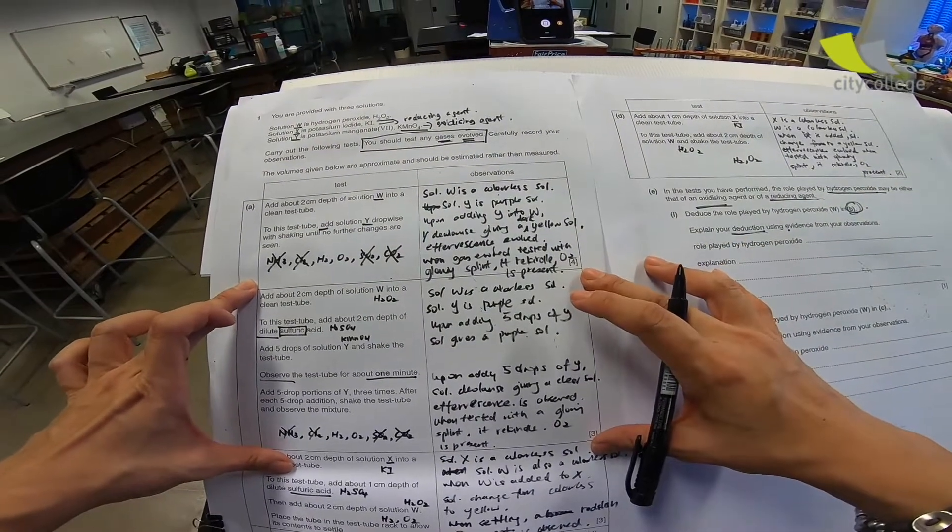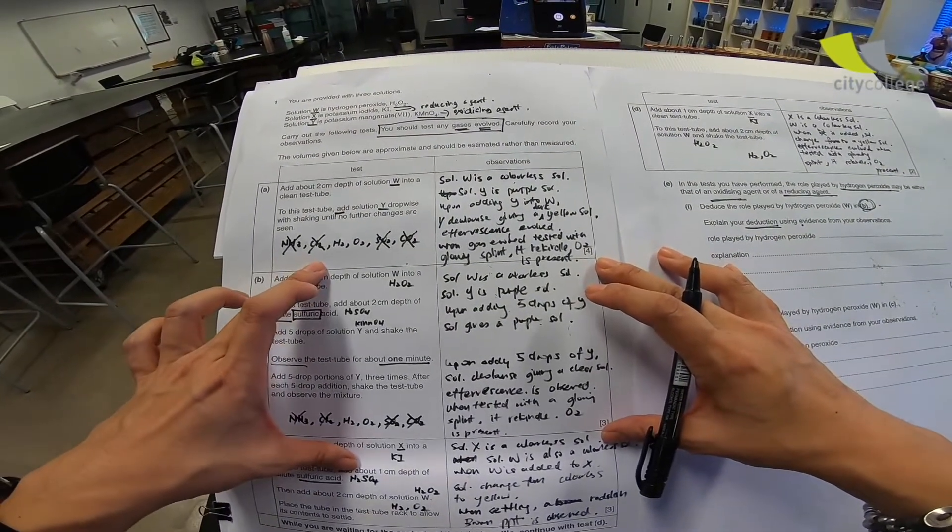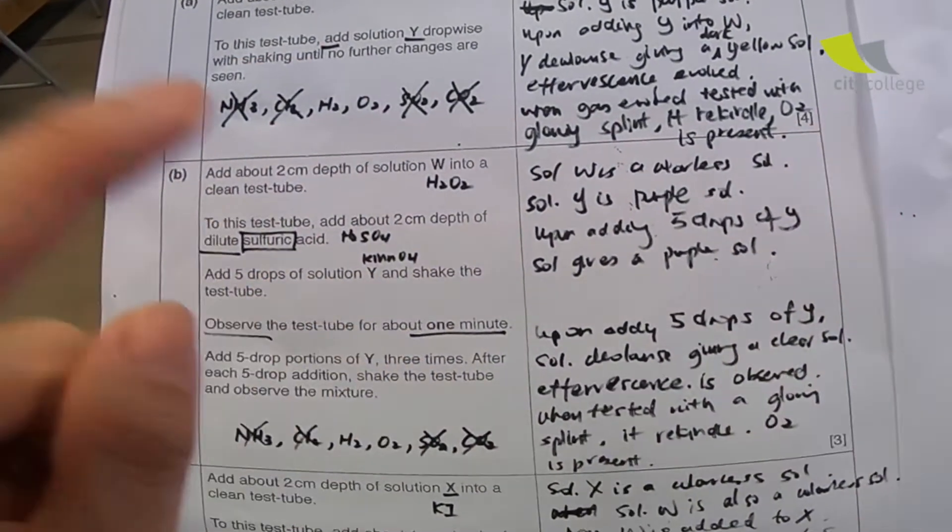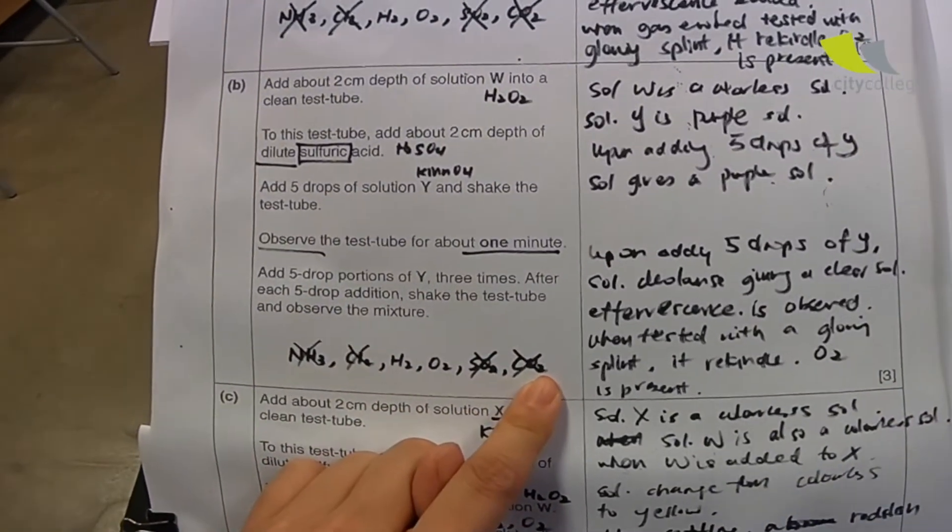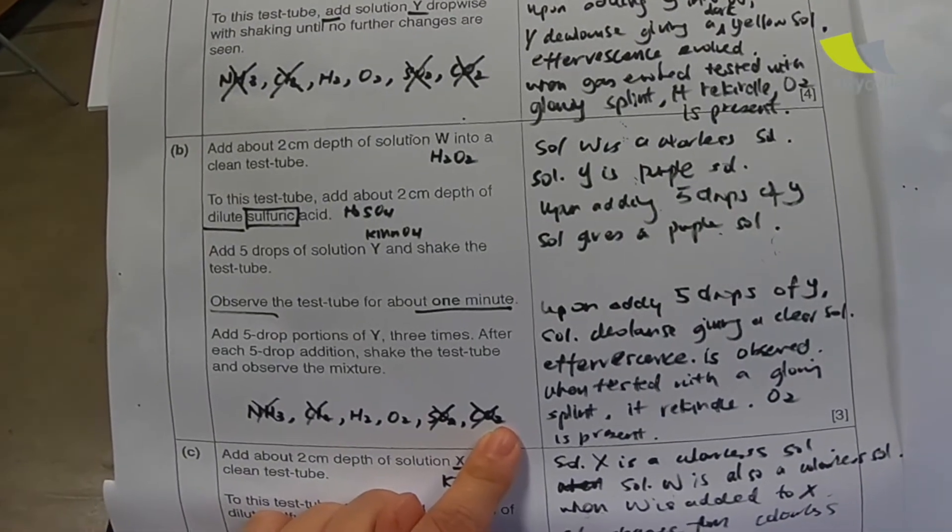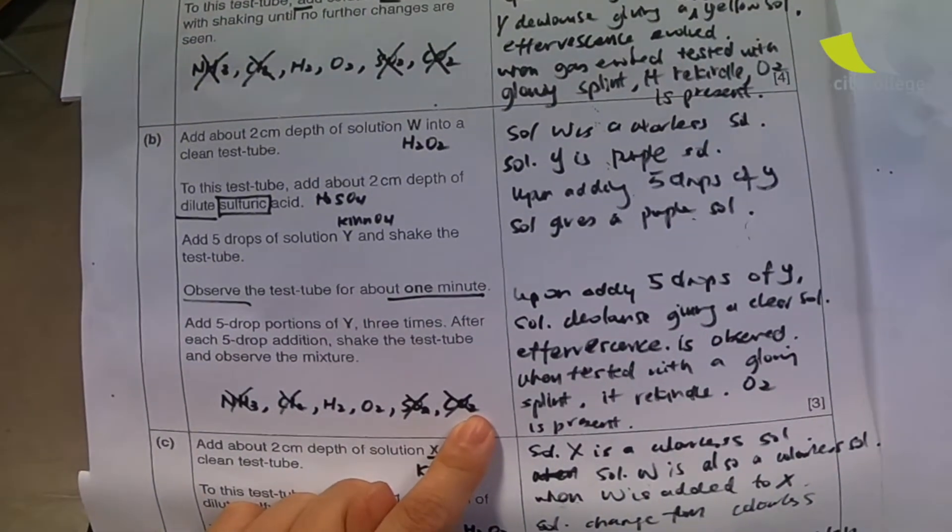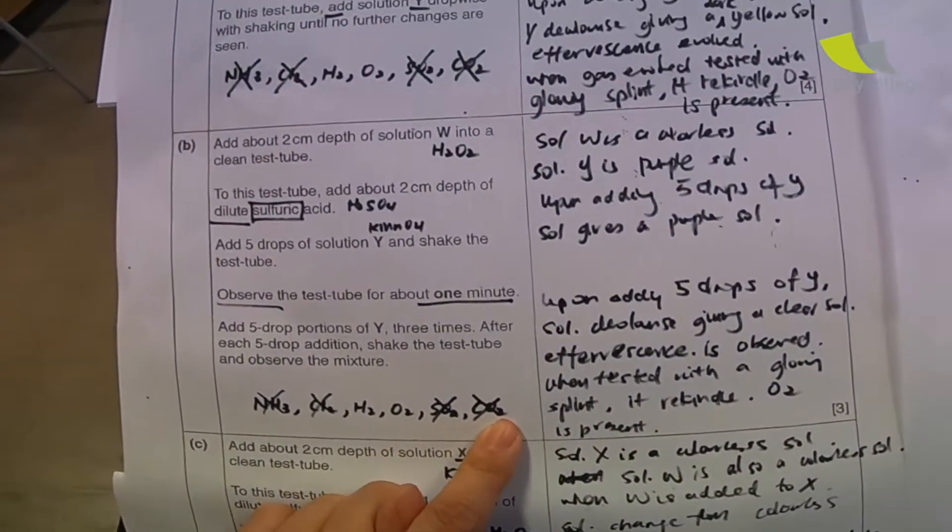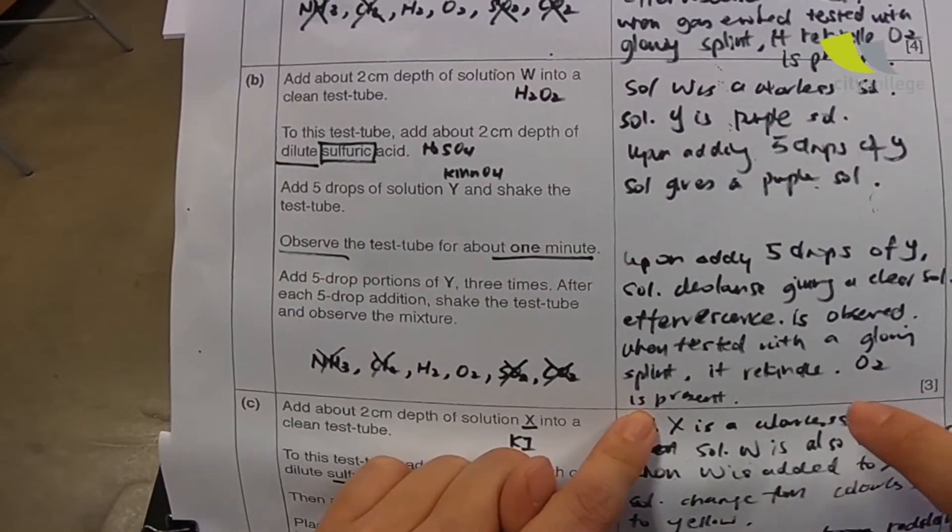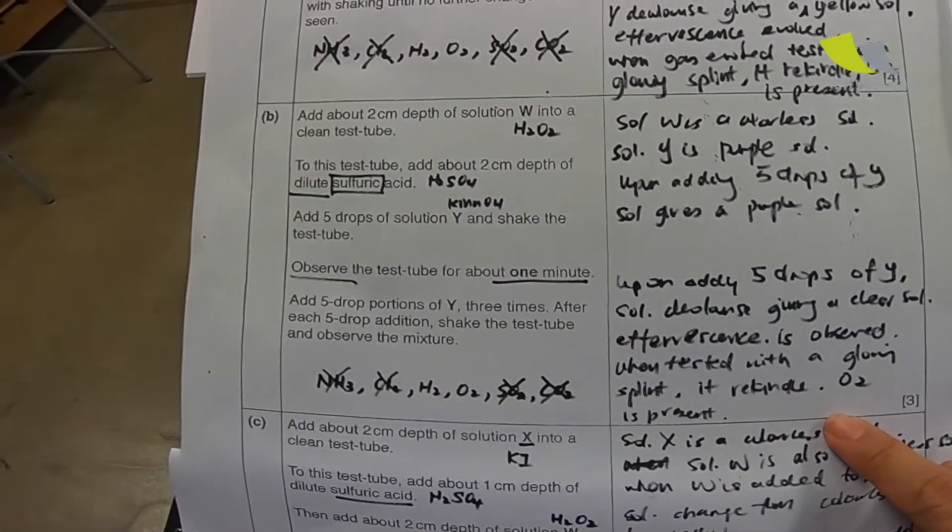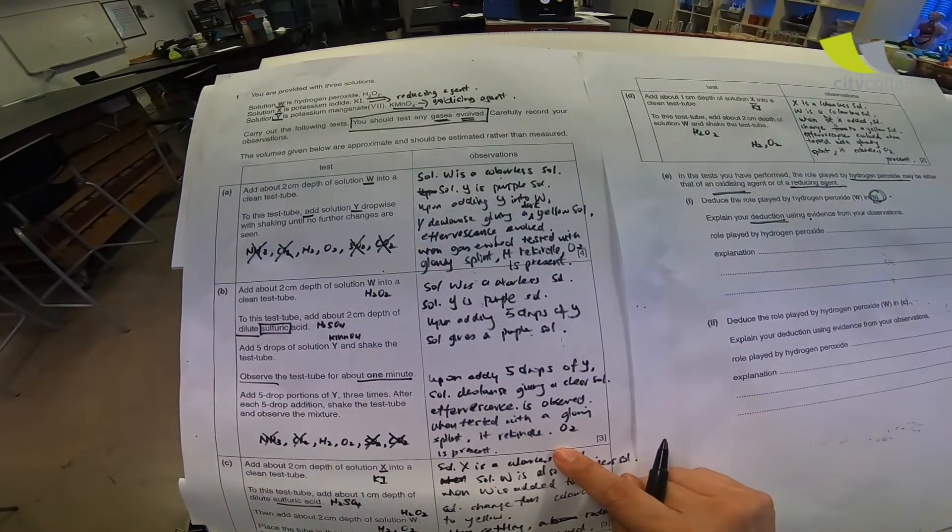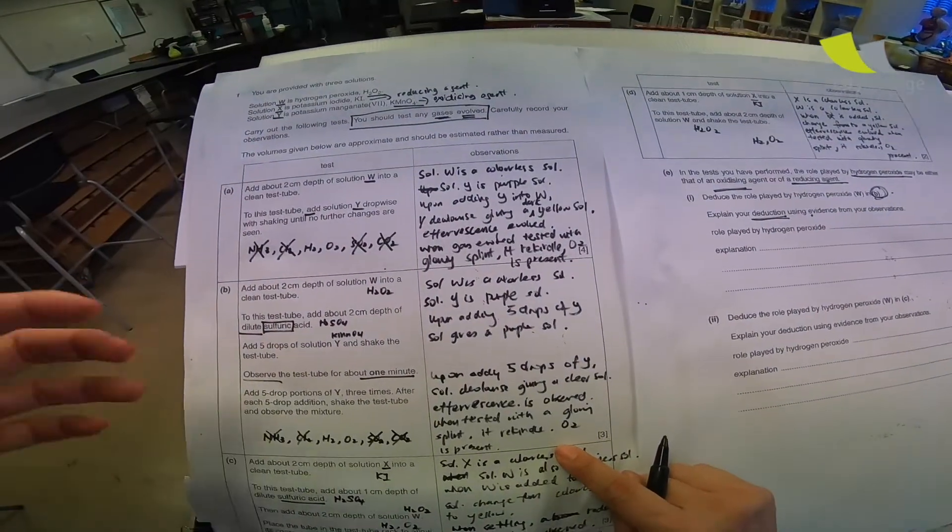Now, I want to draw your attention to part B, this portion. Because some of you will have realized that, hey, part B, Ms. Salina, just now we saw that you actually insert the lighted and the glowing splint inside. Both didn't show any evidence. That means the glowing splint didn't rekindle. The lighted splint did not give a pop sound. Well, in the experiment, sometimes you really cannot get a result.